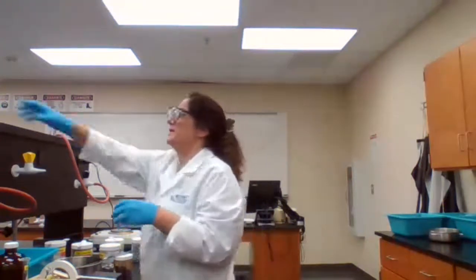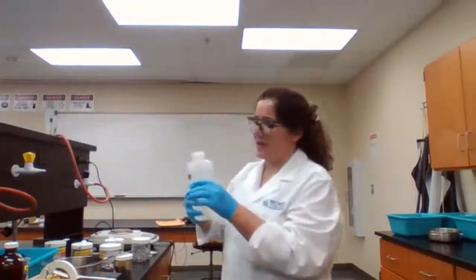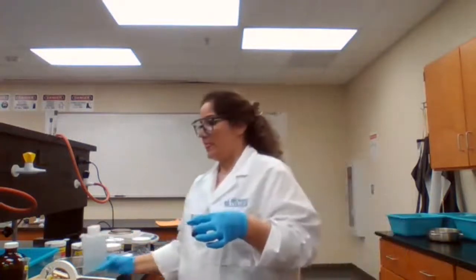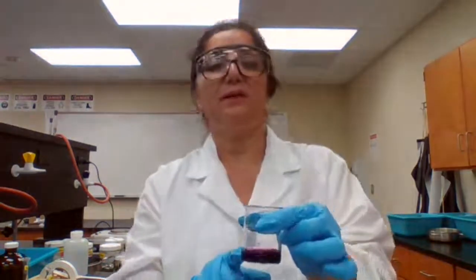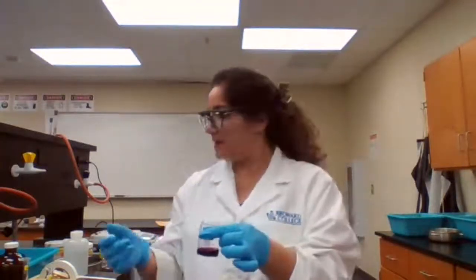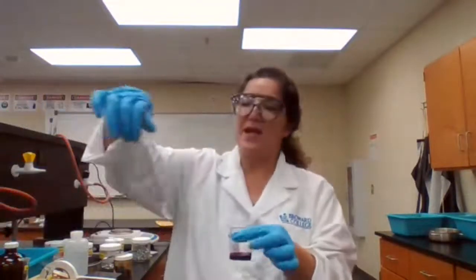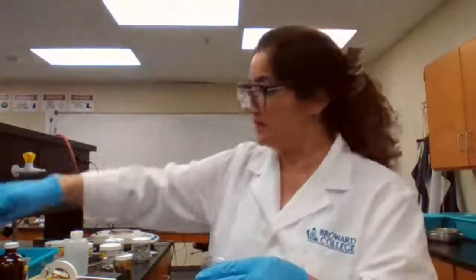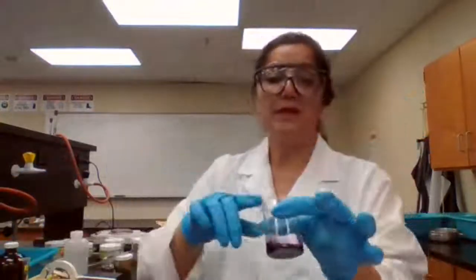What's supposed to happen here is we are supposed to have a purple color, and the purple color of permanganate should disappear when we are adding oxalic acid. So in this case, because the permanganate that we have has no color, we cannot record a time for color to disappear. So I have to make a fresh solution, but my fresh solution might be too pink.